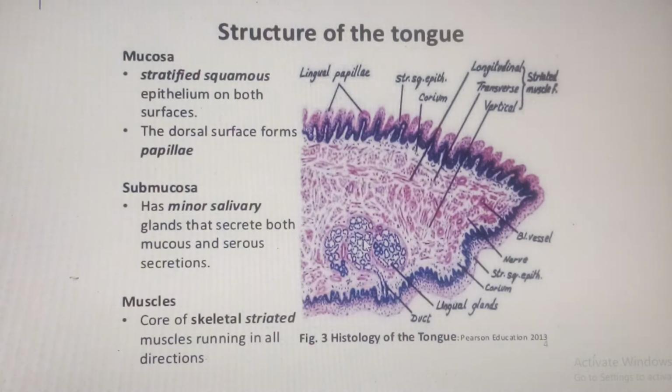Now, what you find very striking is that these glands will be found in the submucosa. In the oral cavity structures, if you talk about minor salivary glands that are not discrete, which are embedded in these oral structures, one thing you have to know is that they will be embedded in the submucosa, not the mucosa. The mucosa is made up of epithelial lining and lamina propria of loose connective tissue. It doesn't contain glands. But the area in which you are going to find glands, made of dense irregular connective tissue, is what we call the submucosa.